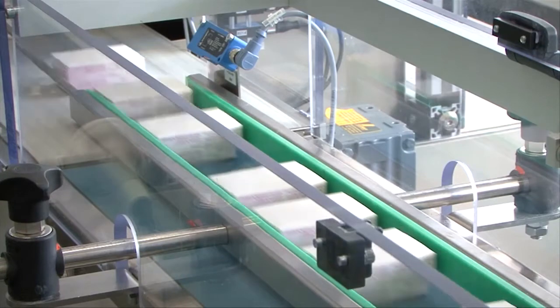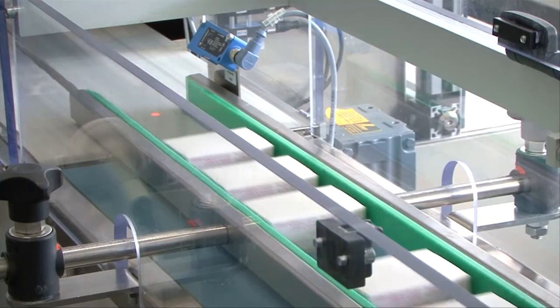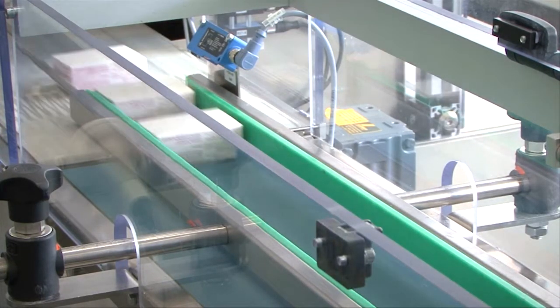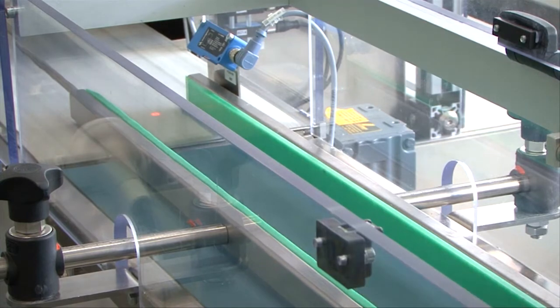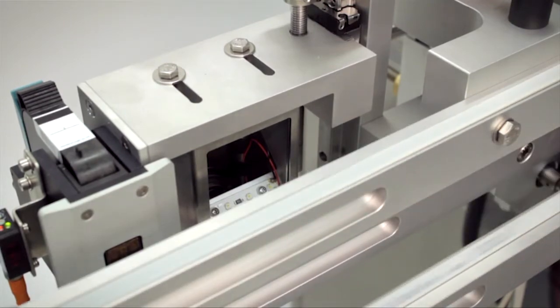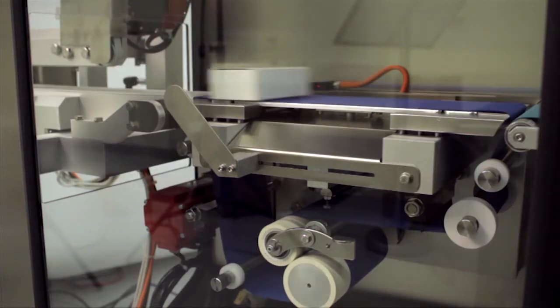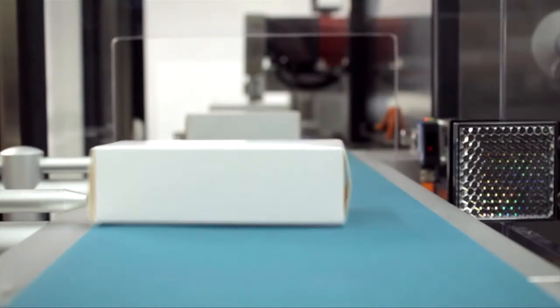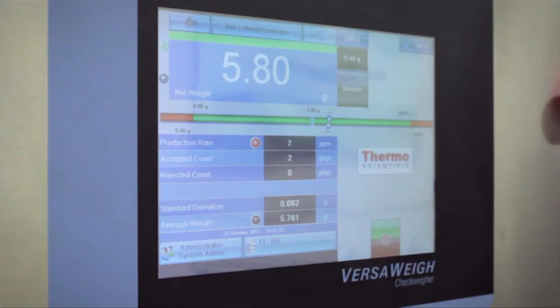Marking and verification for track and trace applications can be applied via a standalone station, but that means additional equipment taking up space in a plant's product line. By having the marking and verification station mounted on a checkweigher, critical space is freed up in the product line. This avoids the need for line splitting and reduces costs of purchasing an additional standalone marking and verification system.